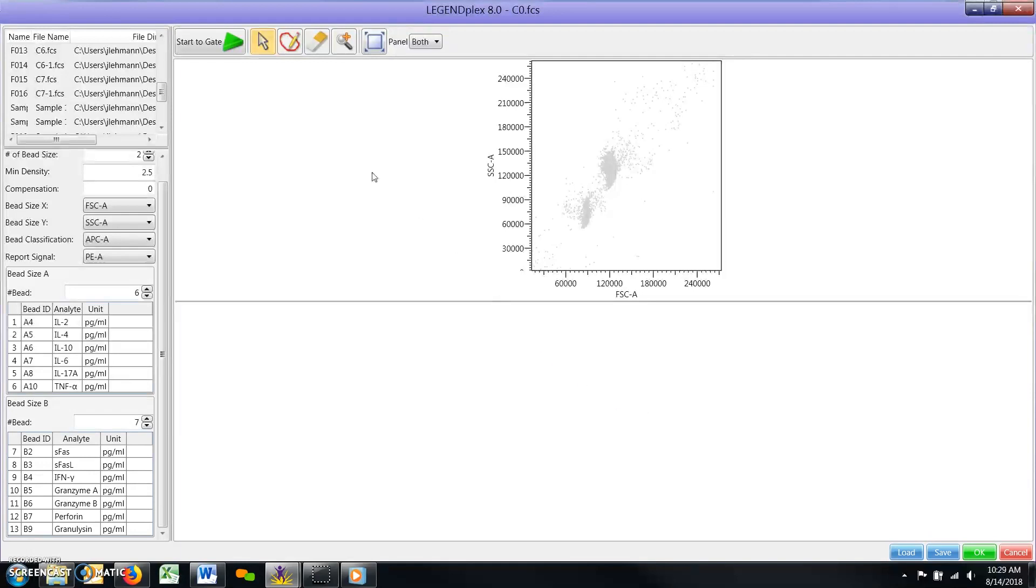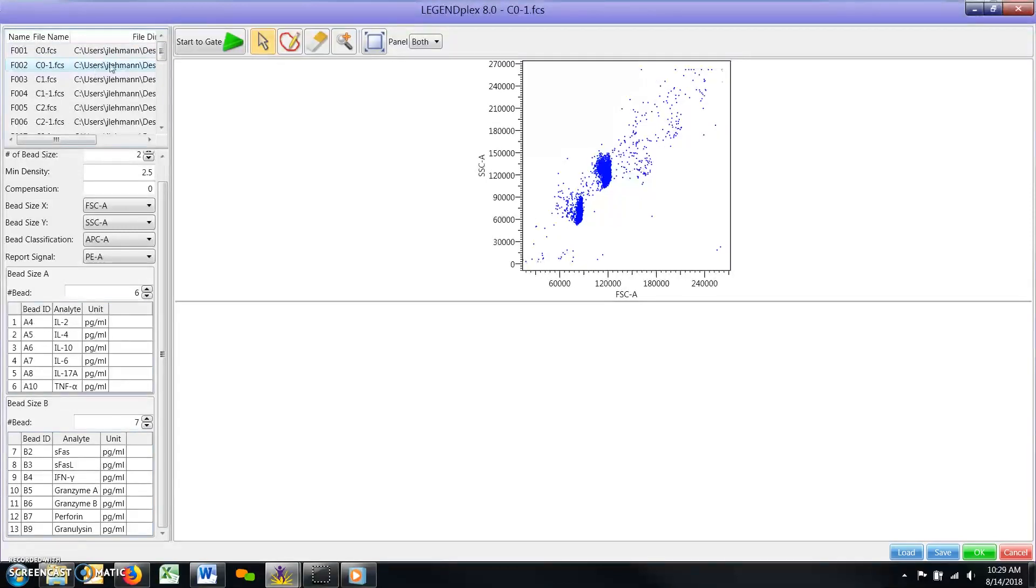As such, at this point in the analysis, you cannot adjust the gates for only one FCS file, as any changes will be applied to the rest of your files as well. We will discuss the proper procedure for adjusting gates for specific individual FCS files later in the tutorial.